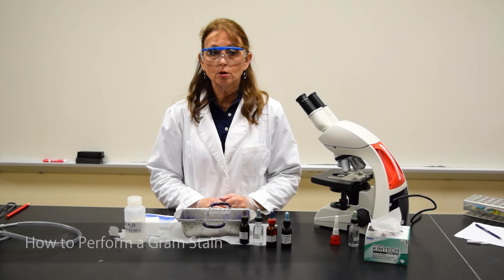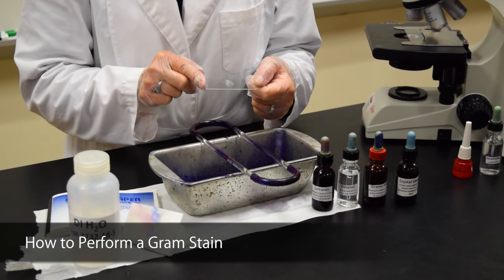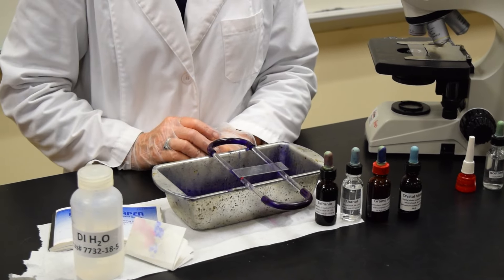This demonstration is to show you how to perform a gram stain. You start with a slide that you've added your specimen to and you've heat fixed. Place it on the rack which is held underneath the tray.